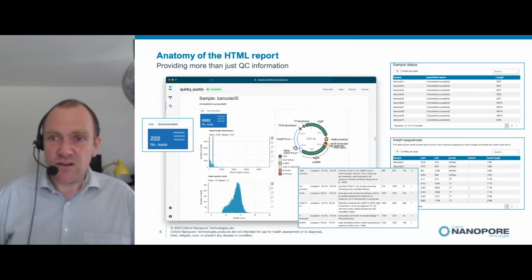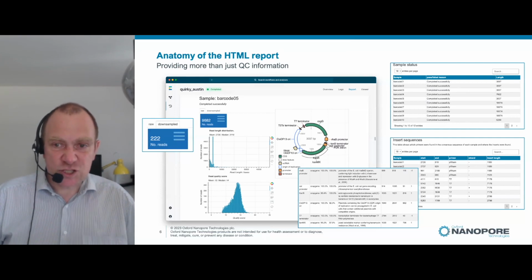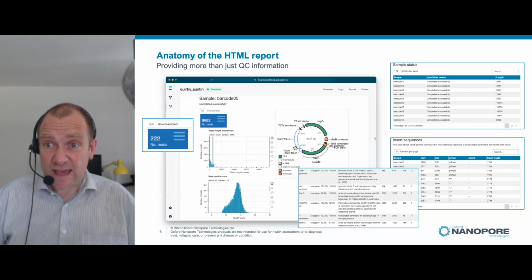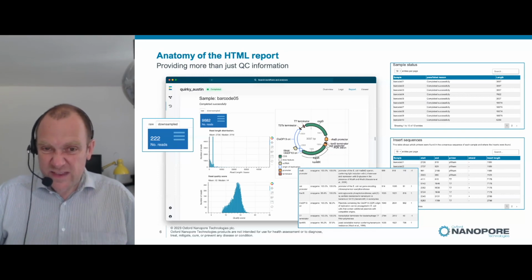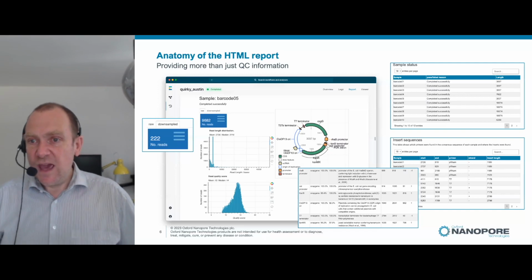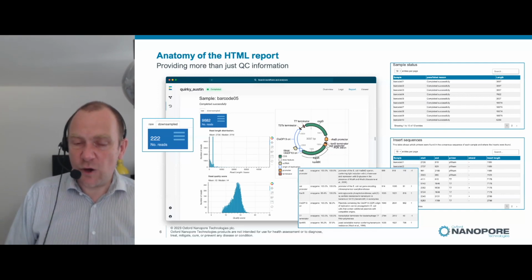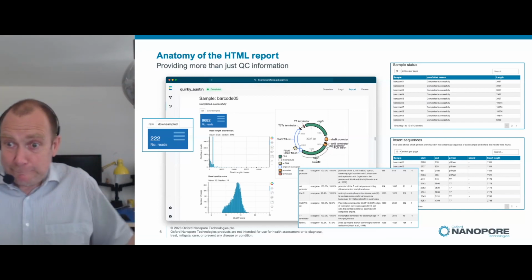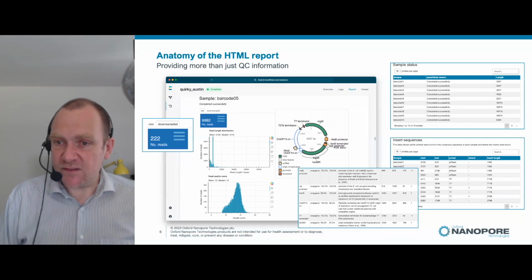To the right-hand side of the screen, we can see that there's a little bit of other information. We're going to present for each of the barcodes that are observed within a sequence set what is the success, or what is the end state of the analysis. In this case, we can see that they all completed successfully, and we can see the length of the circularized plasmid. So there's a little bit of variability here. We've looked at a number of different plasmids, some of which are replicates, and hey, there's numbers. It entirely works. This is exactly what we were expecting to see.